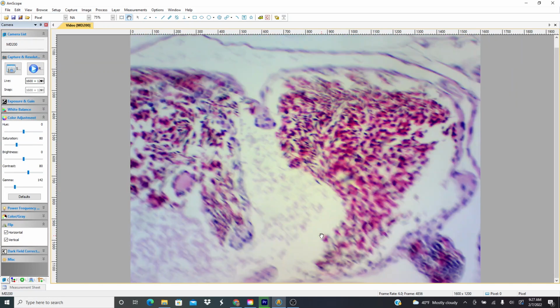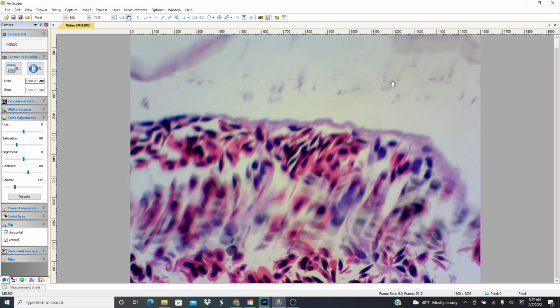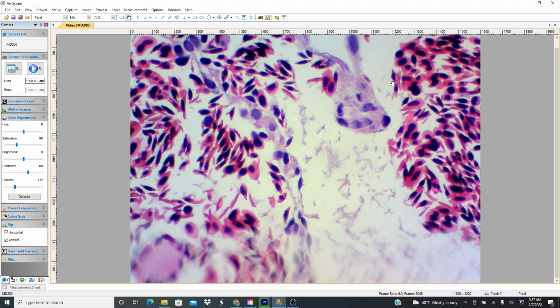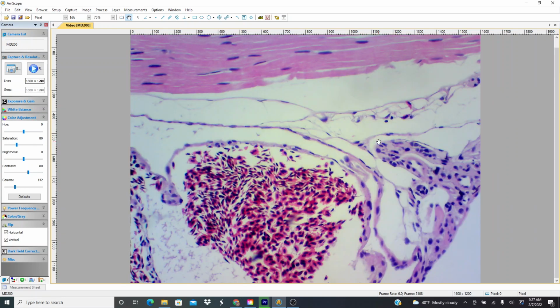Now, over here, this is interesting. There's this structure, it's kind of a round, oval thing. I don't know what it is, but it contains a lot of red blood cells. And the funny thing about these red blood cells is a lot of them, you can see, have this sickle shape, this elongated shape, which is what you see in humans. You would call that sickle cell anemia. I'm not sure what the structure is, why it contains all this blood. This is very fascinating, honestly. This is like an outer lining to this thing. I'm not sure what this thing is.